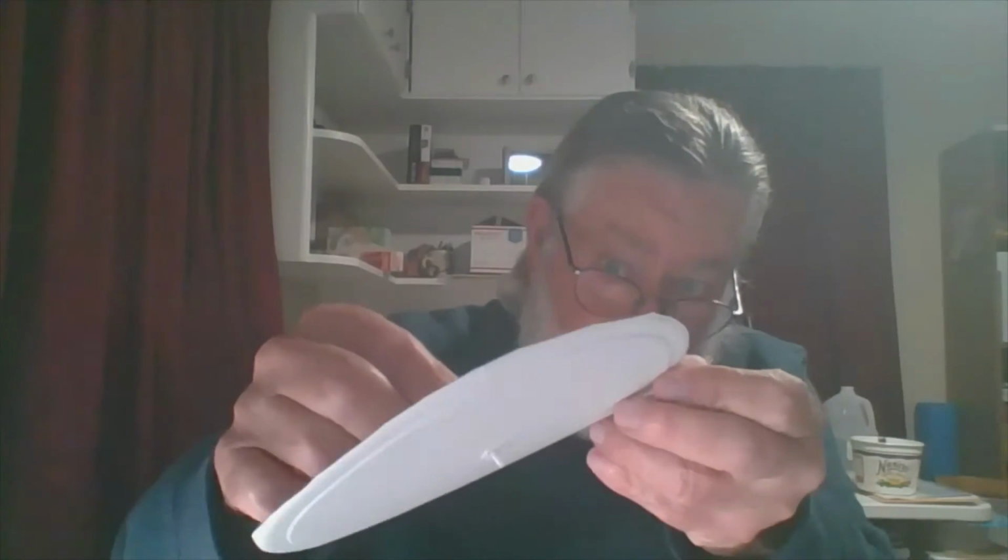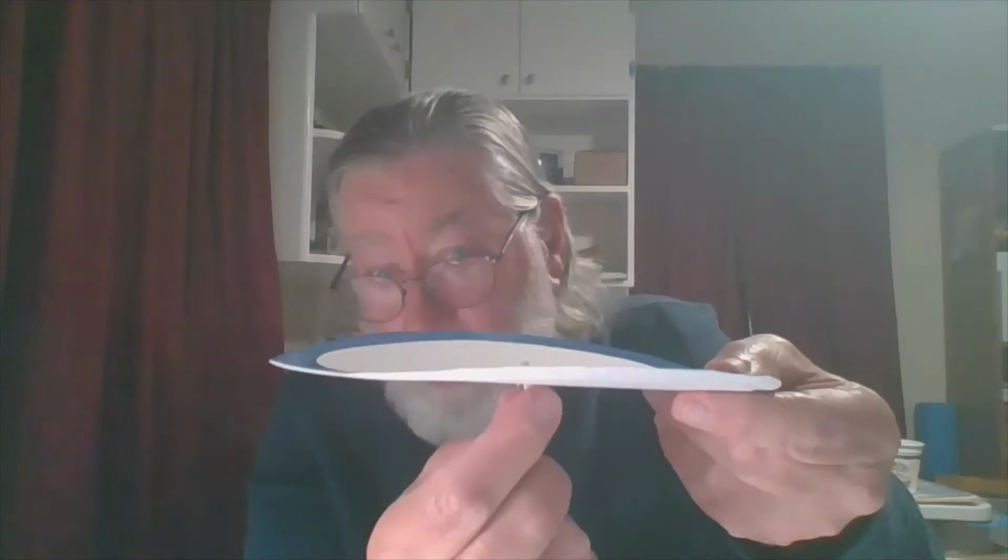Then we want to take it out, put it on our support dish. And this is an important step because we don't want to tear a hole, make the hole bigger in the filter paper. We lay it on there and we gently pull the wick out so we don't enlarge that hole. Then we set that aside to dry, and you can just set it on the lid that came with the 90 millimeter dish to dry in indirect light.